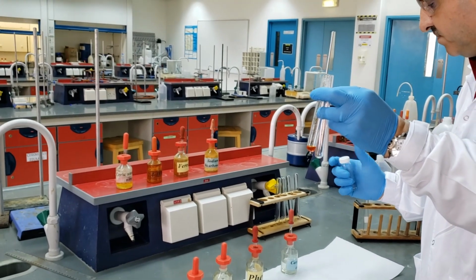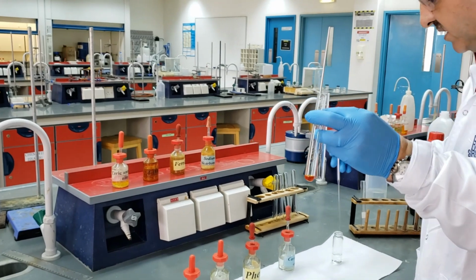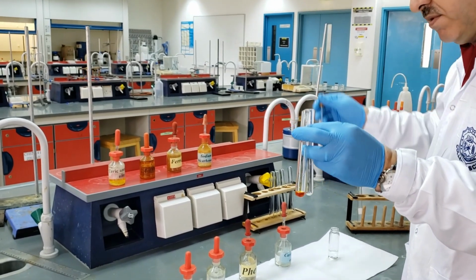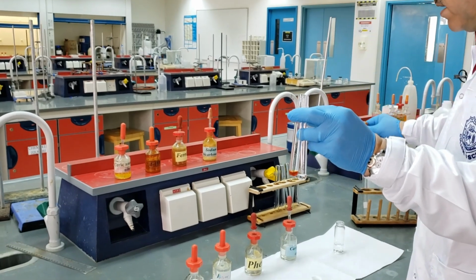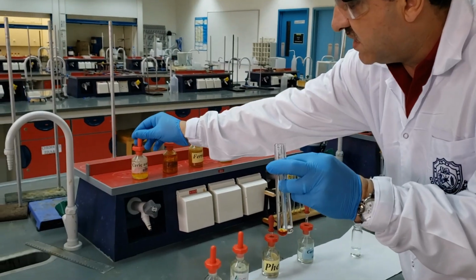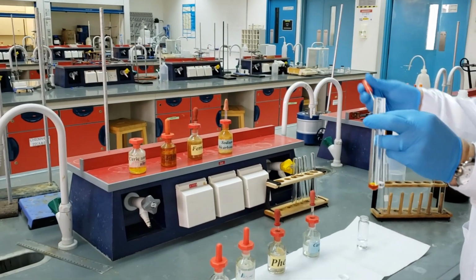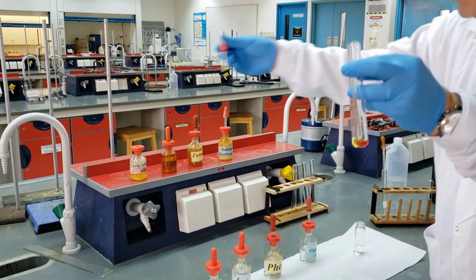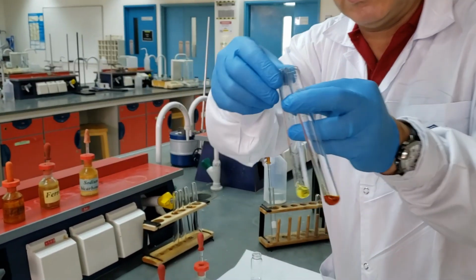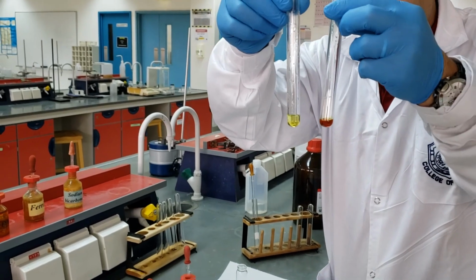I do the same. I take 1 milliliter of my unknown, I add it to another test tube, and then I add the same reagent for the test of alcohol functionality. As you can see, there is a huge difference. The result of this chemical test does not match.